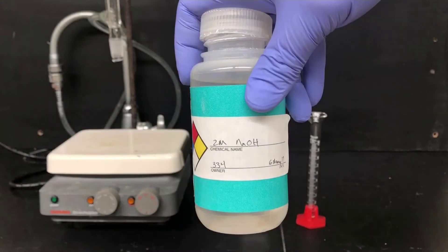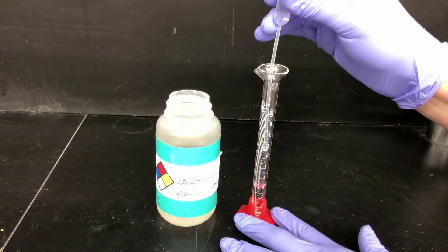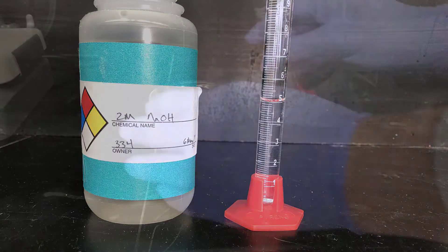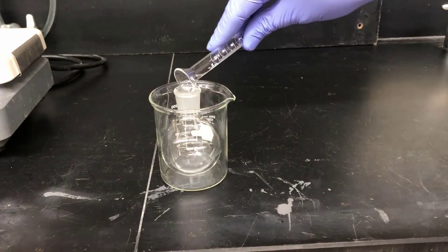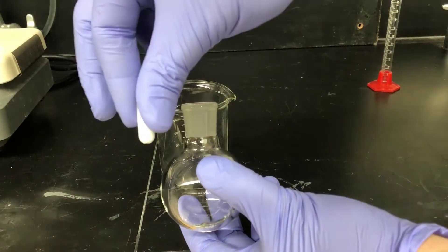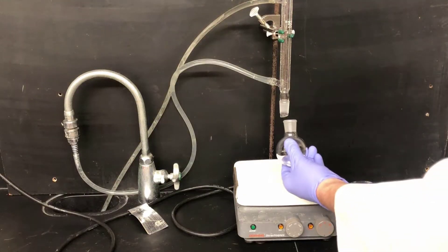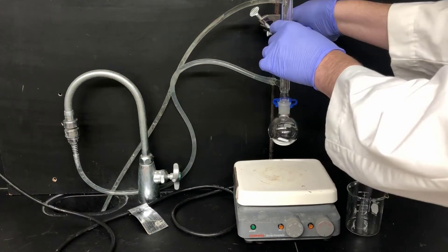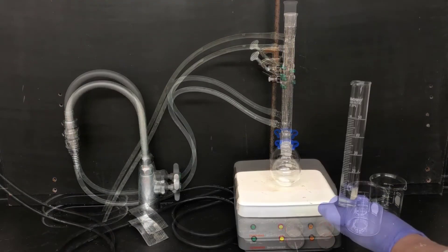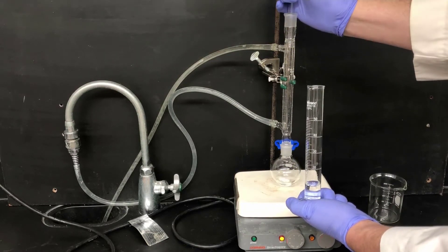Next, I'll be measuring out 2 molar aqueous sodium hydroxide, NaOH — this is the catalyst for today's experiment. I'm measuring out 5.00 milliliters of this solution. Now I'll pour that sodium hydroxide solution into a 100 milliliter round bottom flask and add a stir bar. Next, I'll attach the flask to the reflux apparatus and get the solution stirring, then add the propanal through the top of the condenser into the reaction vessel.